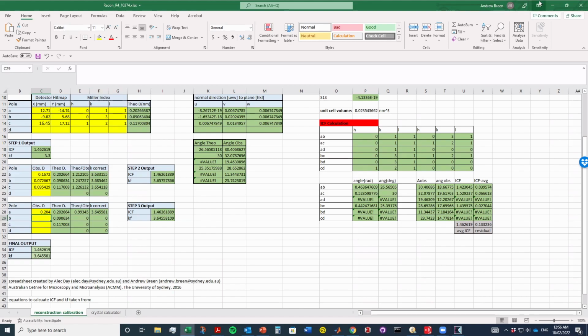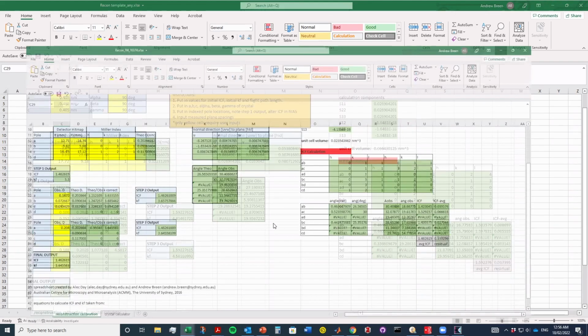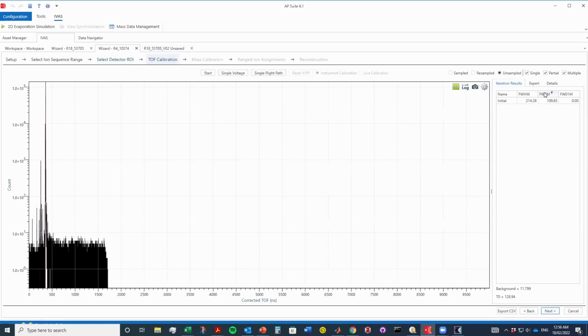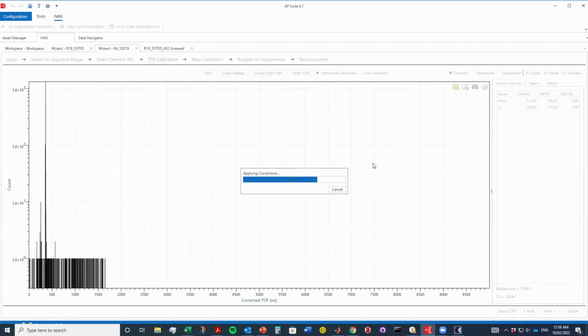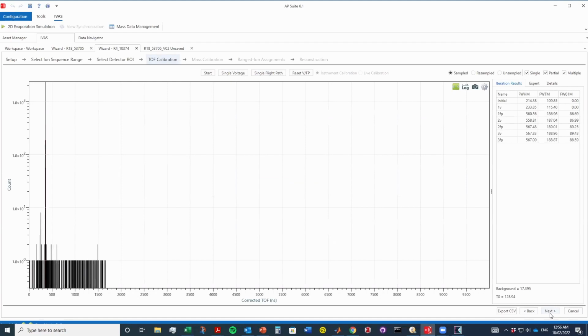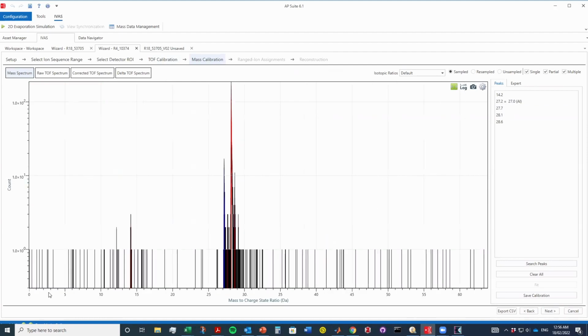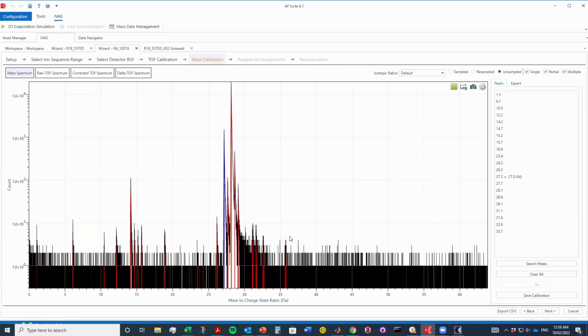So yeah, we just enter it in the spreadsheet like that. Just to show you that we can in fact get a spatial distribution map on that pole and how that works again. Yeah, this is going to be a bit. This is a multi-component alloy, right? So it's going to take a bit of time.